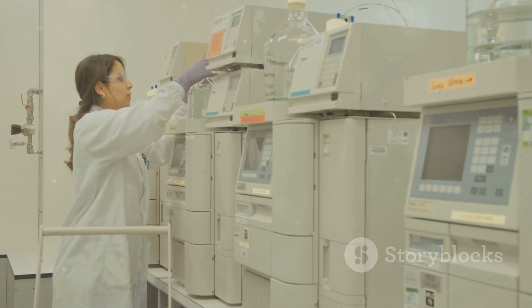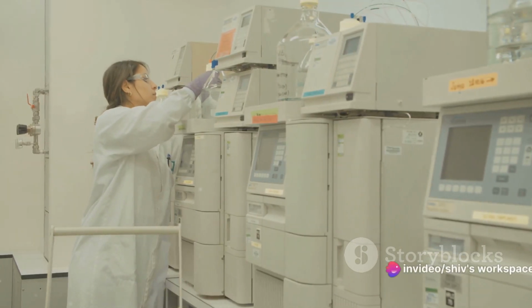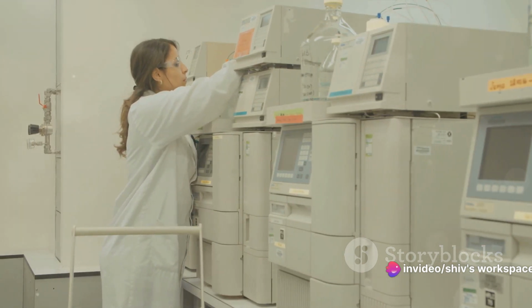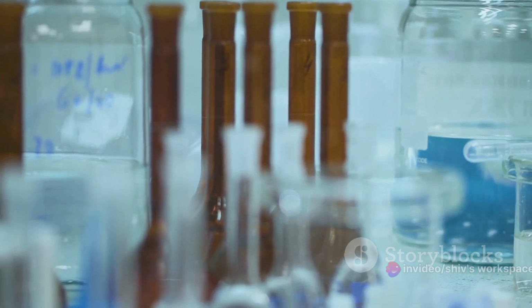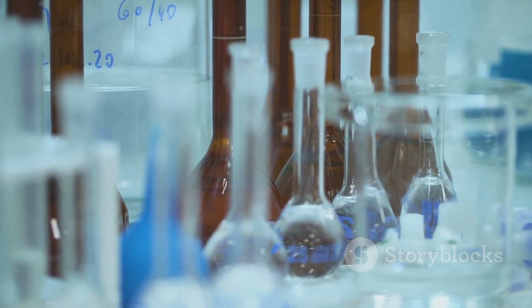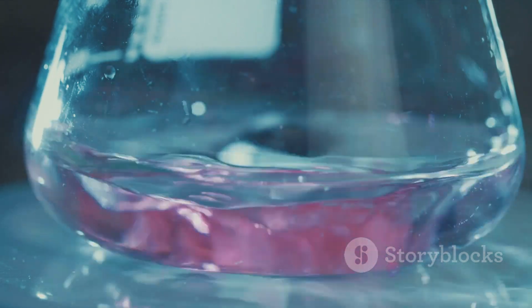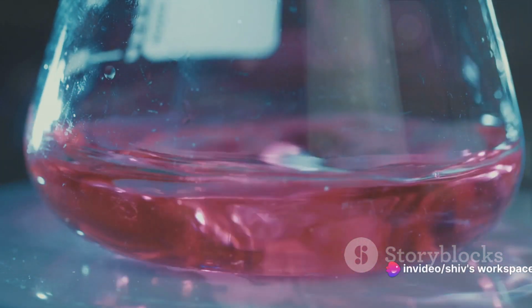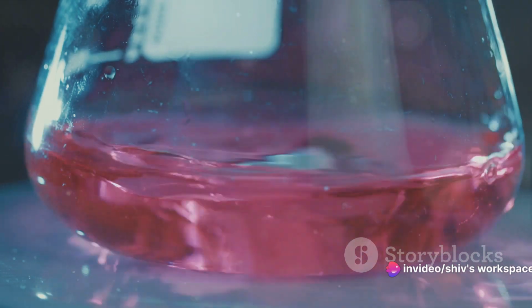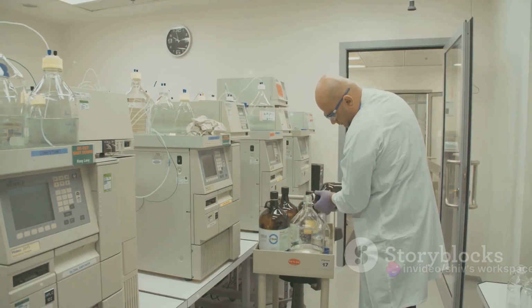Next, we have the injector. This is where the sample is introduced into the system. The sample, once injected, is carried into the column by the mobile phase. The real magic happens in the column. The column is packed with small particles, or the stationary phase. Each compound in the sample will interact differently with the stationary phase, causing them to move through the column at different rates. Following the column is the detector.